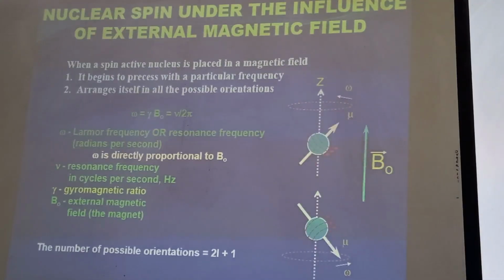If you remember the first lecture, we said that resonance takes place when you apply radio frequency. So resonance always takes place when two waves are interfering with each other. When they have the same frequency, they will match with each other, and you can observe resonance then.